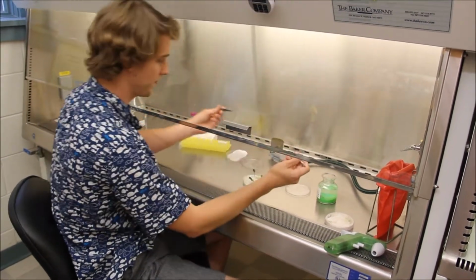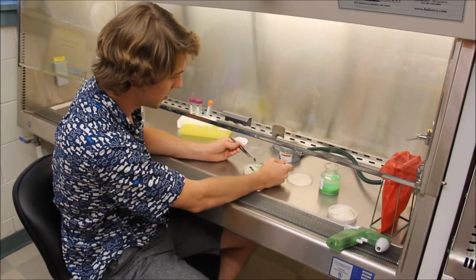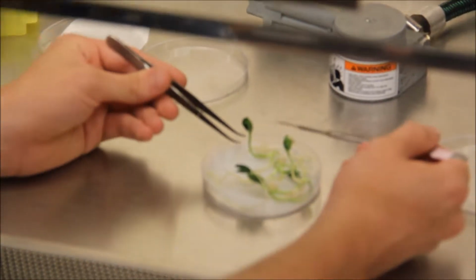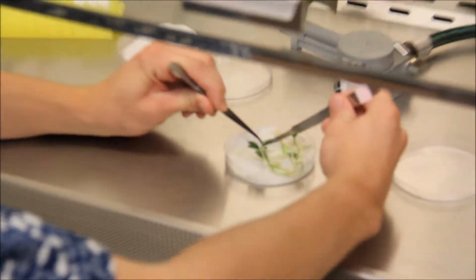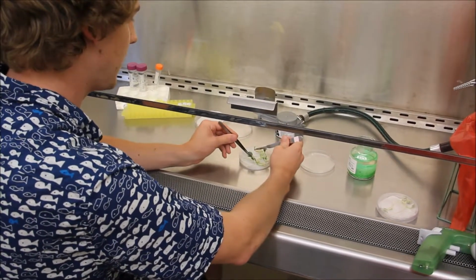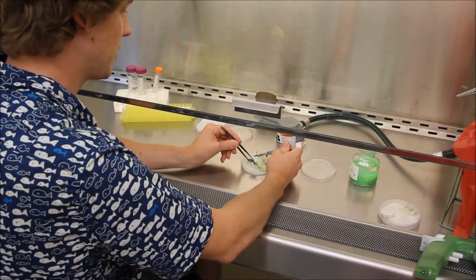So you grab your tools, and with the bean, you really want to cut off anything that has emerged from it. So what would become the root structure and what would become the first true leaves that form after the cotyledon stage. So you want to cut about 1 centimeter under here, like that. And then you want to divide it in half, basically. So you'll split the bean into its 2 halves by slicing right through it.